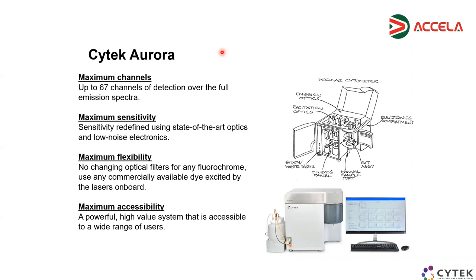It's quite complicated. I don't think it's just about adding the piezoelectric plate. It's really about totally changing one part of the optics and the fluidics. It's really a redesigned type of instrument. Yeah, so it's quite complex. Okay. Thank you so much. All right.